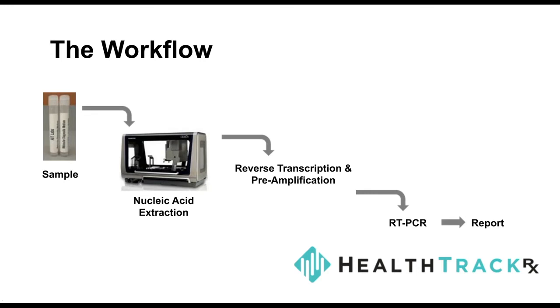So we spent, again, a significant amount of time in developing automated processes for the extraction, and once we have the nucleic acid in hand, we follow it up with reverse transcription and pre-amplification of the samples, because what we ultimately went with was a nanofluidic real-time PCR-based platform, which allowed for really high throughput performance of the PCR, followed by the real-time PCR that I was talking about, ultimately leading to the report, which is the product that we put out for the providers and the patient. Again, we have streamlined this workflow, which minimizes any wastage with respect to time and resources for all our different sample types.